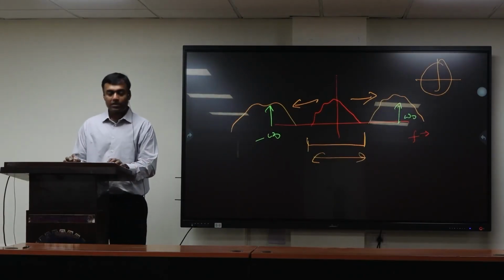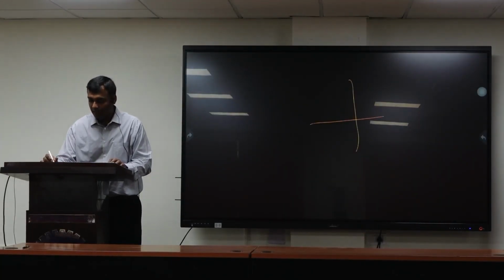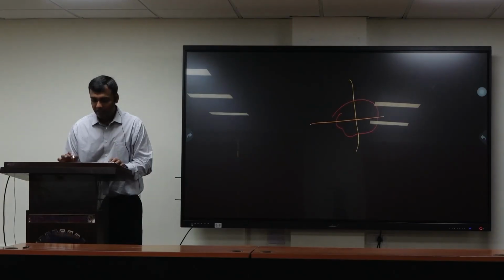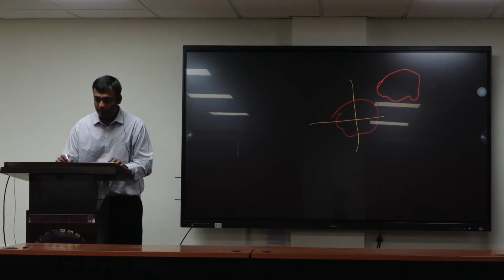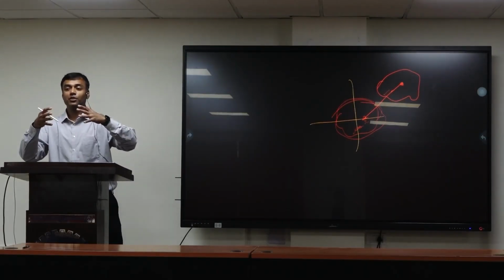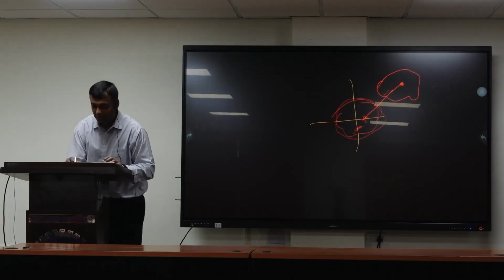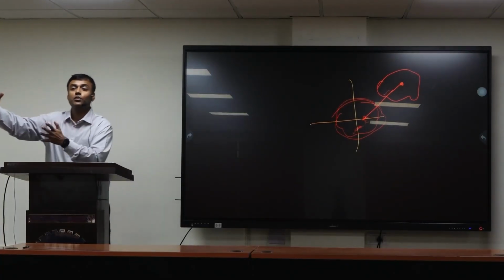So if you do frequency shifting, what happens? Let me erase this. Your object in the frequency domain is like this, and you have shifted it here. If your origin is here, the high frequencies that were here are now inside the field of view in the Fourier domain. So you have shifted the frequencies so that what were previously high frequencies have come to the low frequencies.